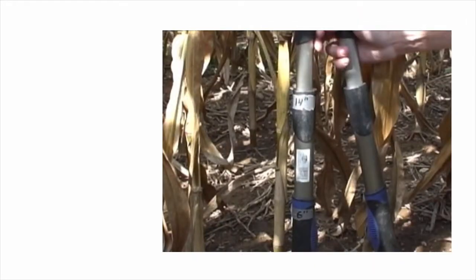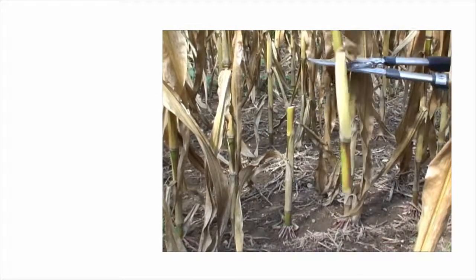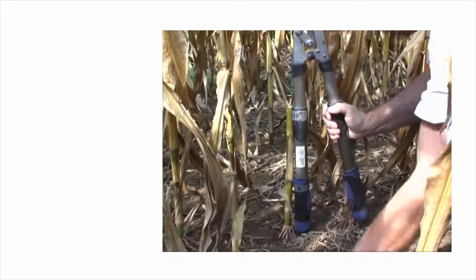An 8-inch stalk section beginning approximately 6 inches from the ground needs to be harvested for analysis. A pruning shears is a good tool to harvest samples with. You may find it convenient to mark the shears with a tape at 6 and 14 inches to make sampling easy and consistent.